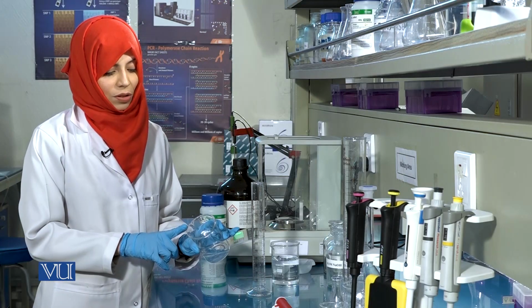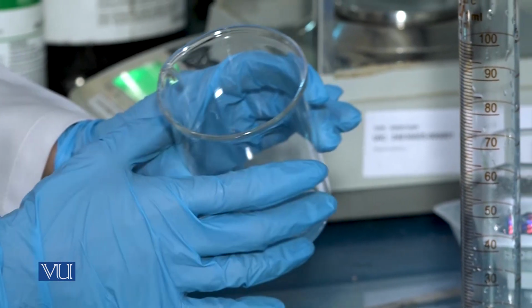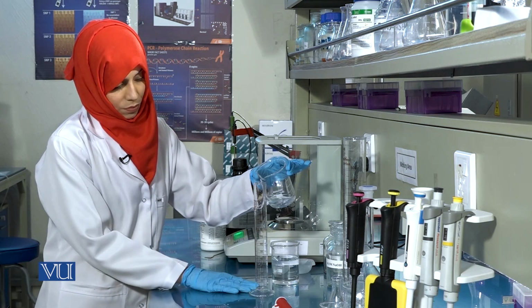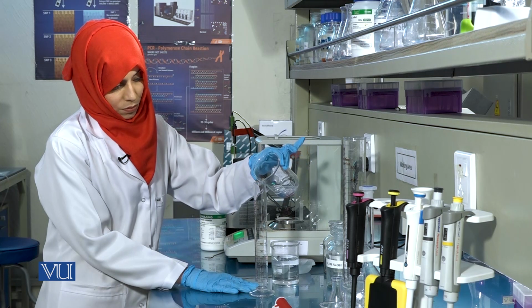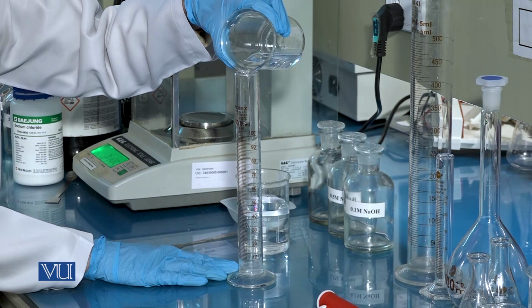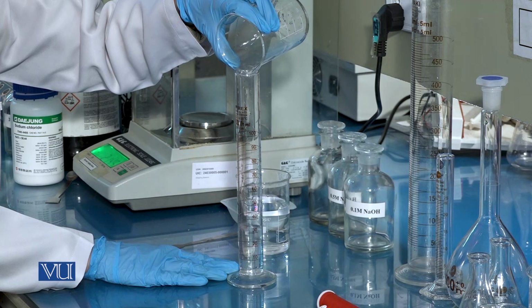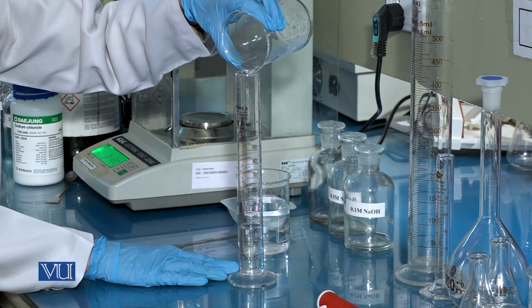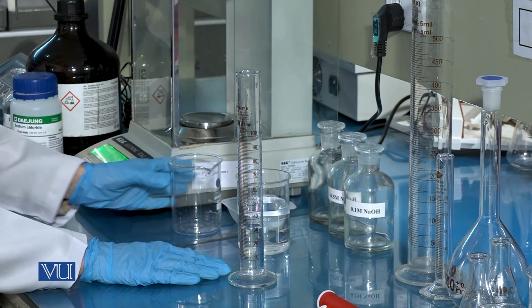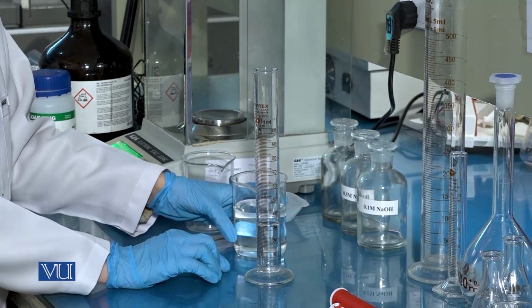Once the salt has dissolved completely, transfer this to a measuring cylinder. Next, raise the volume of this solution to 100 ml using distilled water.